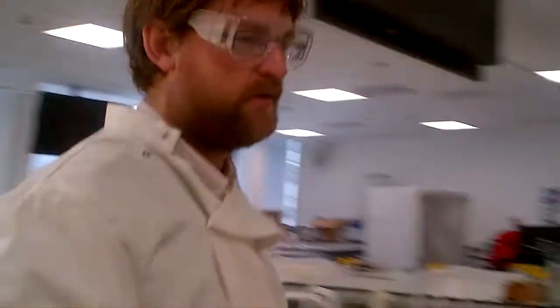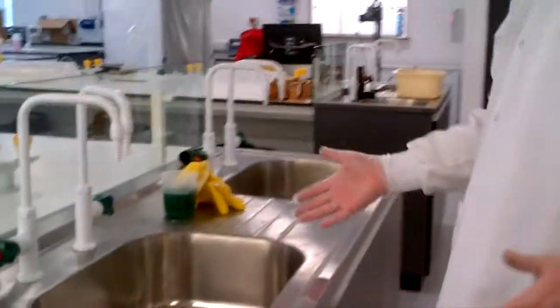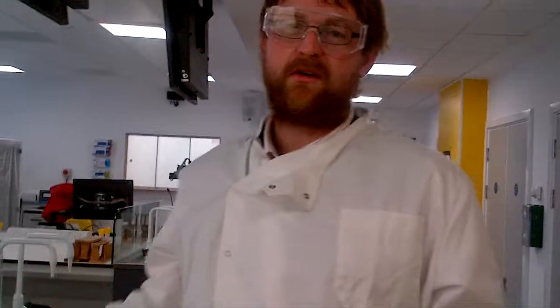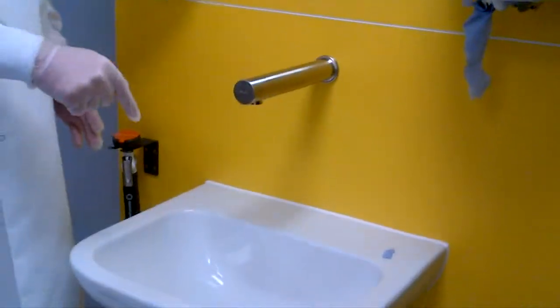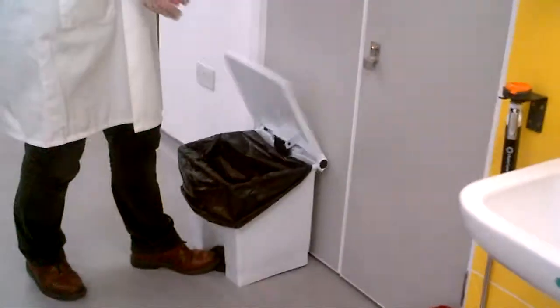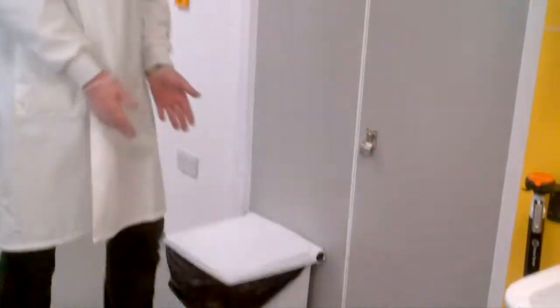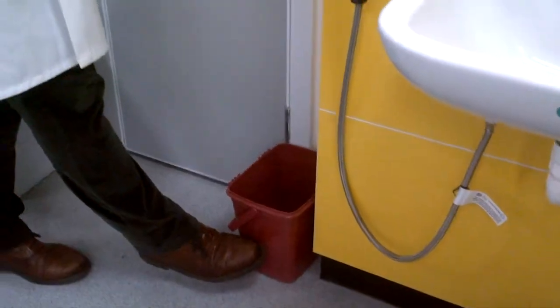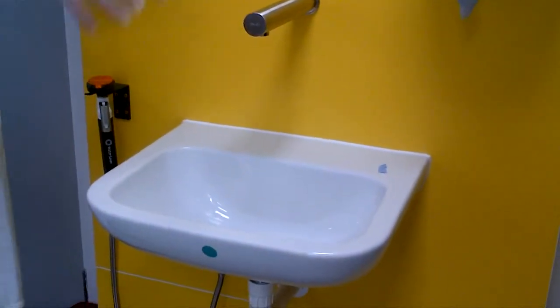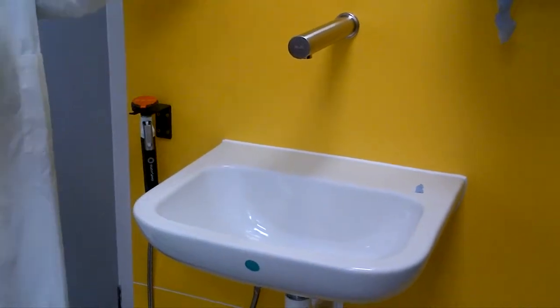If you walk around the lab, we're in Area 4 at the moment, you will see sinks for hand washing and face wash, and sinks for chemical disposal. What we don't want is any chemicals down these sinks. So should you feel at any point that you need to wash your hands, please take your gloves off. We will get very annoyed if we see chemicals going down here. We'll be bitterly upset with you.